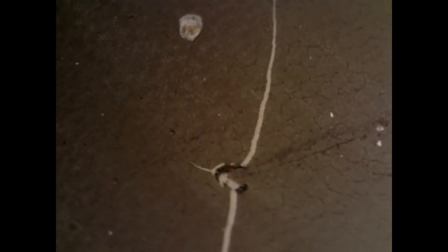On some close-up images, where you have two spots close together, they seem to bridge between each other. You get these almost like arches of black between them. This is a very light area of coating, very fine layer.